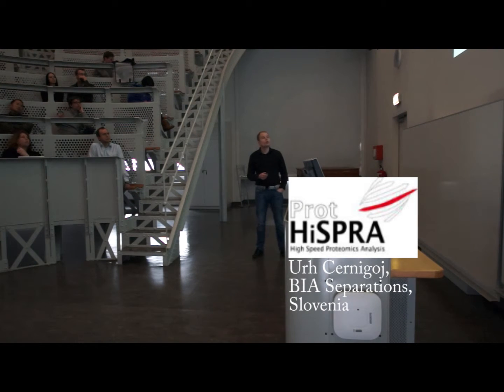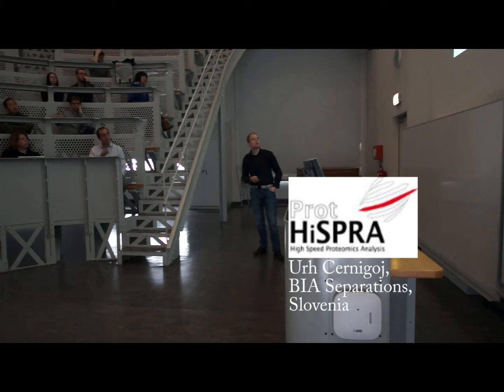And with the rutile nanoparticles, we had to increase a little bit the pore size of the monolith, otherwise the clogging effect was already seen. So when we took the monoliths with the 2 micrometers pore size, we didn't have any problems with clogging, and we could very easily load the titanium dioxide nanoparticles on the monolith, obtaining the capacities. So the capacities, this means how much titanium dioxide was adsorbed on the surface of the monolith. Let's say somewhere between 20 and 30 milligrams of titanium dioxide per milliliter of the chromatographic column.